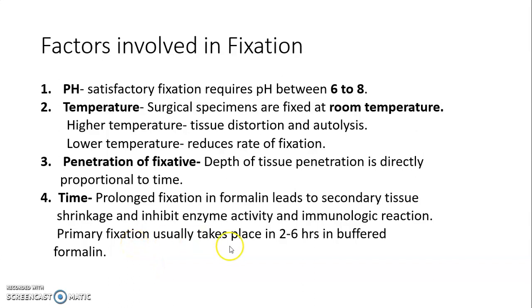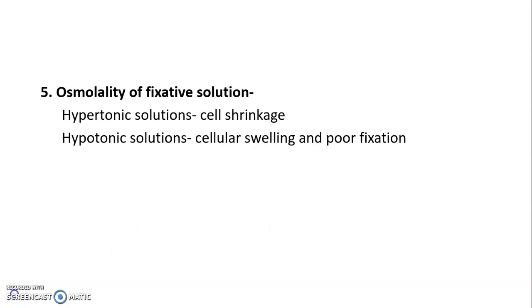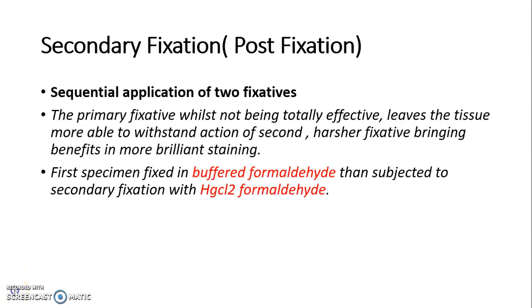Primary fixation usually takes place in 2 to 6 hours in buffered formalin. Osmolality of the fixative solution is also important. If the solution is hypertonic, it will lead to cell shrinkage, and if it is hypotonic, then cellular swelling will occur and lead to poor fixation.